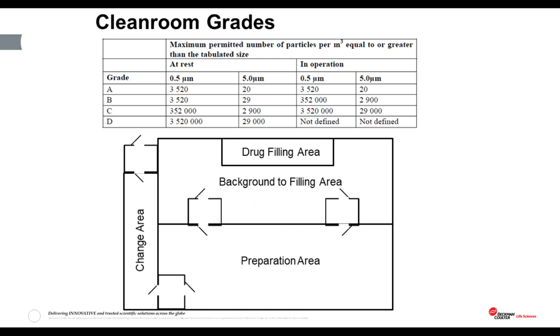Now, people are the biggest source of contamination in the clean room environment. So workers in clean rooms have to pass through several different clean rooms to enter the production suite where the aseptic fill takes place. Each area is separated by an airlock to minimize the flow of air from the dirty outer rooms into the clean production areas.